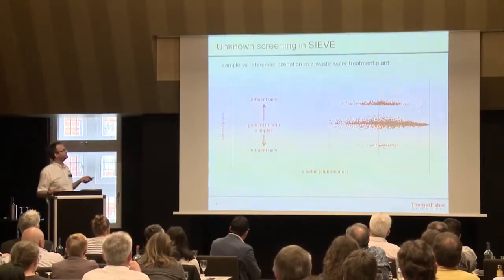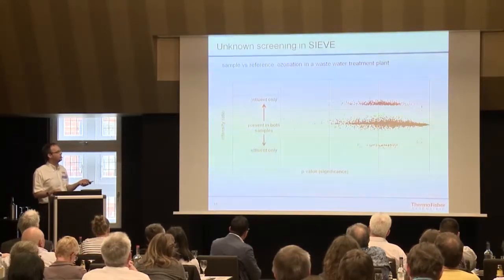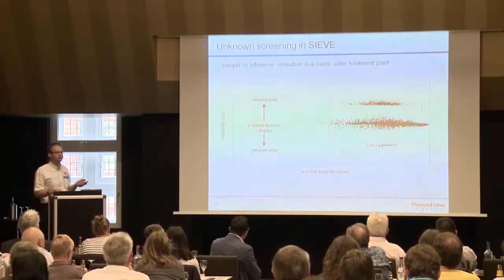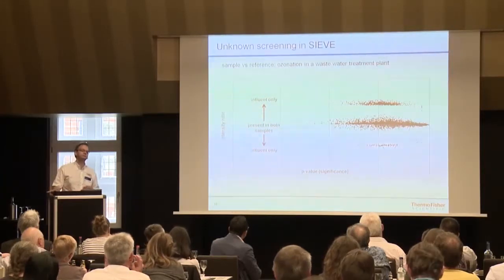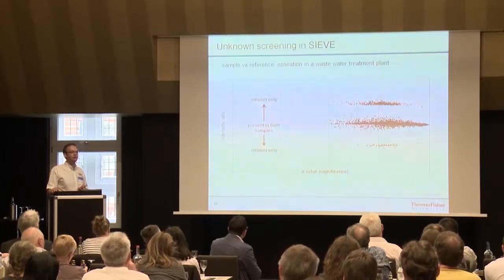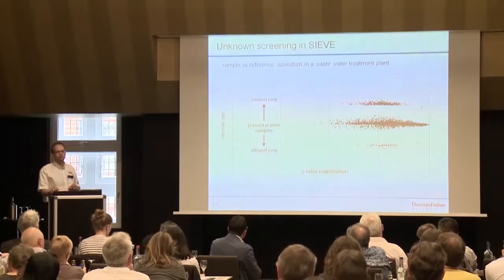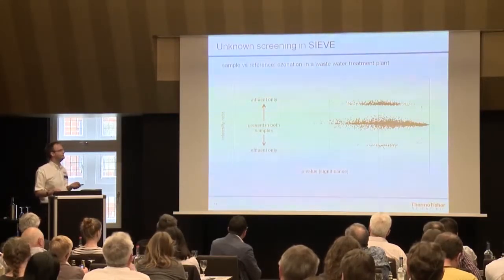If you look into the second step, the ozonation, you see, it looks much better already. So lots of components we really clear up. Not so many, but some we produce, of course. But still we have an amount going in. But that will be a different thing, of course. Many of these will be just background peaks, which are no contaminants. So that's the job of putting a label in the identification step later on onto these peaks.